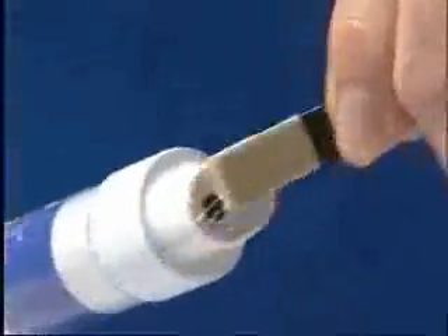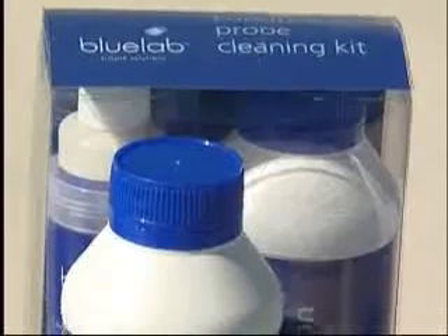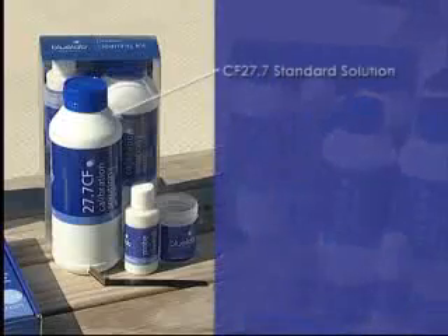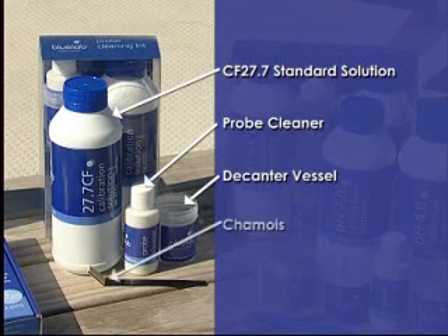The cleaning process is of course simple and takes very little time. Bluelab have conductivity cleaning kits available for cleaning the Bluelab truncheon. The cleaning kit contains a CF27.7 standard solution, a decanter vessel, Bluelab probe cleaner, Bluelab chamois, and clear instructions on how to clean.